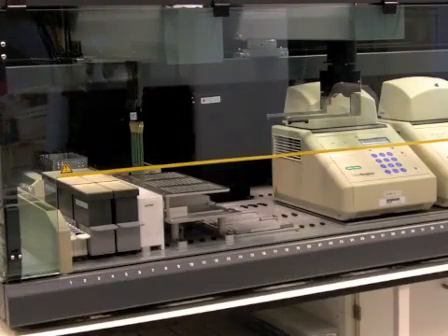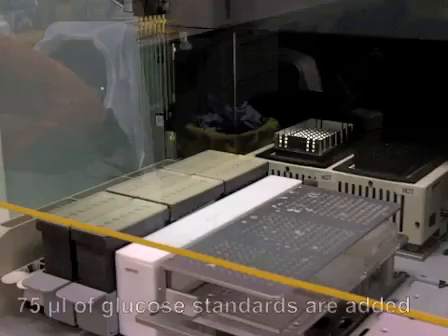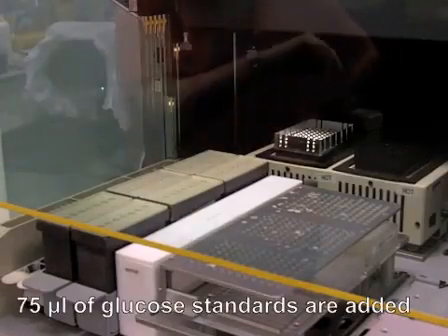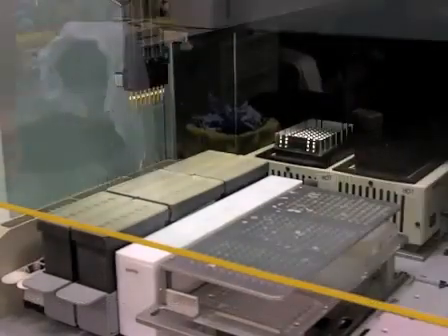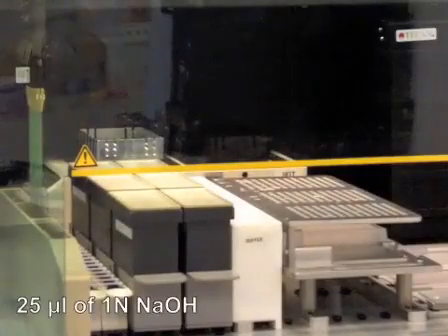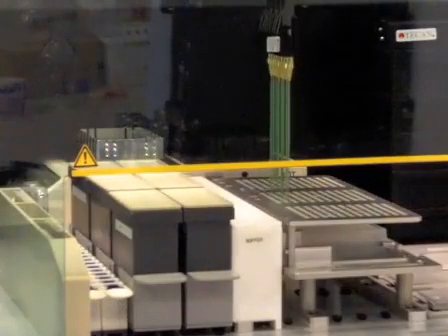75 microliters of the resulting hydrolysate is transferred to a PCR plate. In columns 11 and 12 of the PCR plates, the glucose standards are added. Next, 25 microliters of 1 molar of sodium hydroxide is added to all the wells.